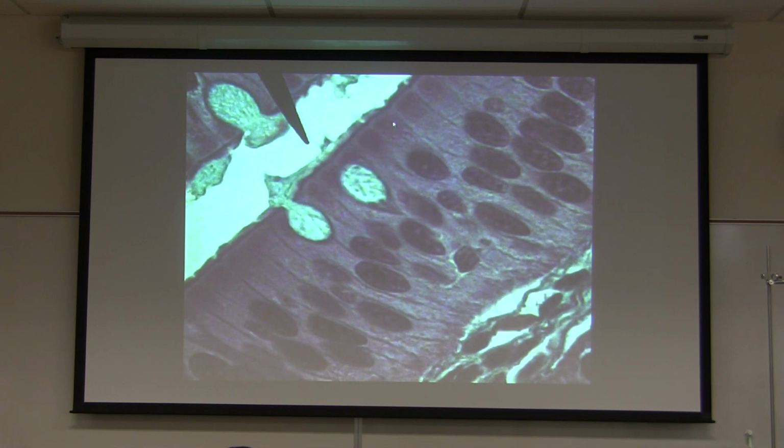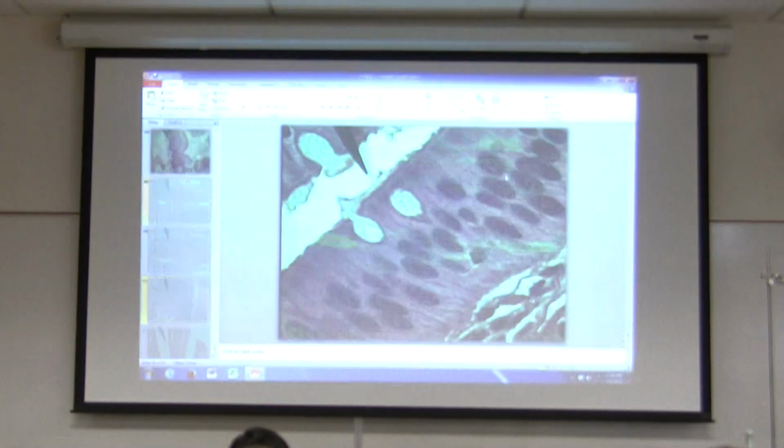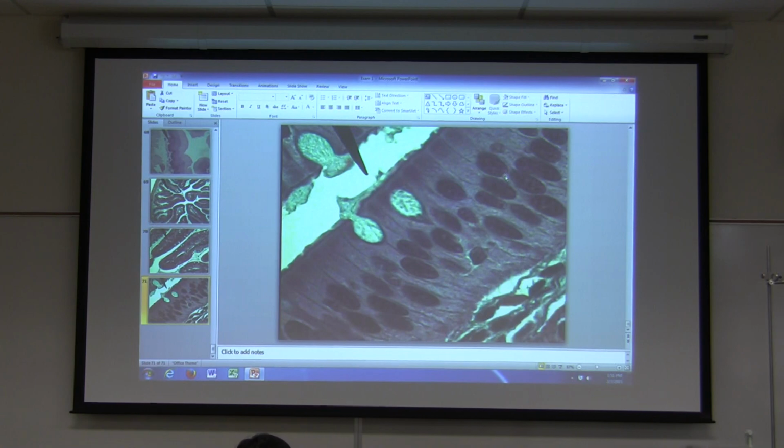And this is a great picture, I think. And again, this is going to give you an impression it's more than one layer, but it's not. Take my word for it. I promise you, it's all one layer. You might think it's not. Is there any question? Everybody's hunky dory.